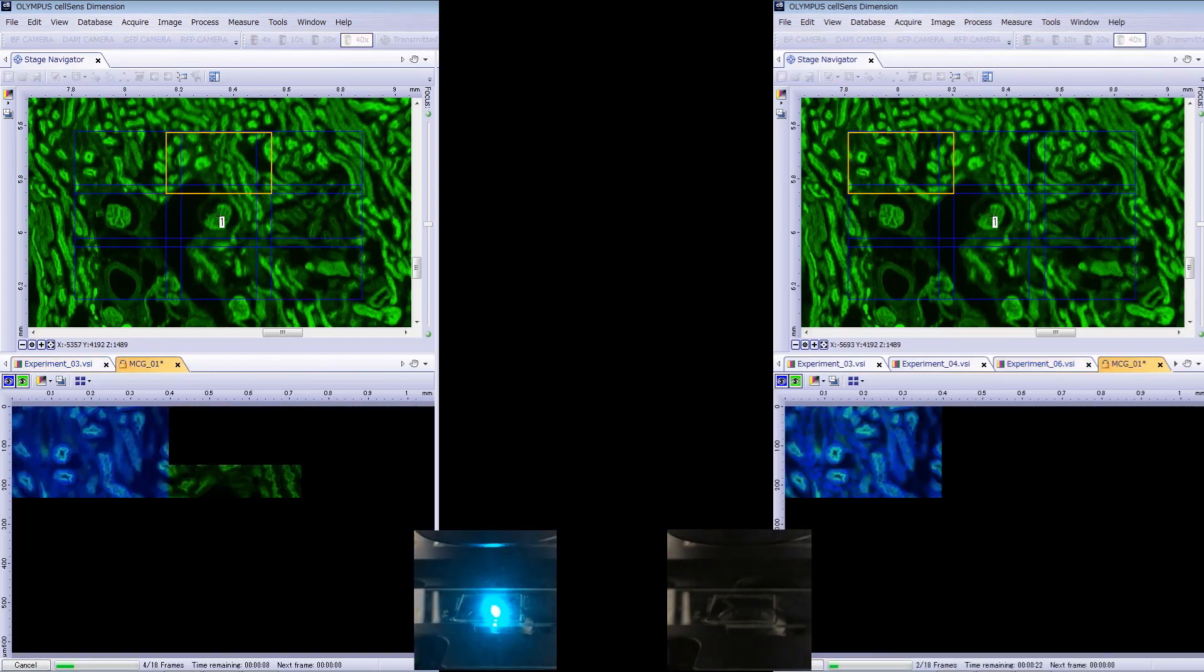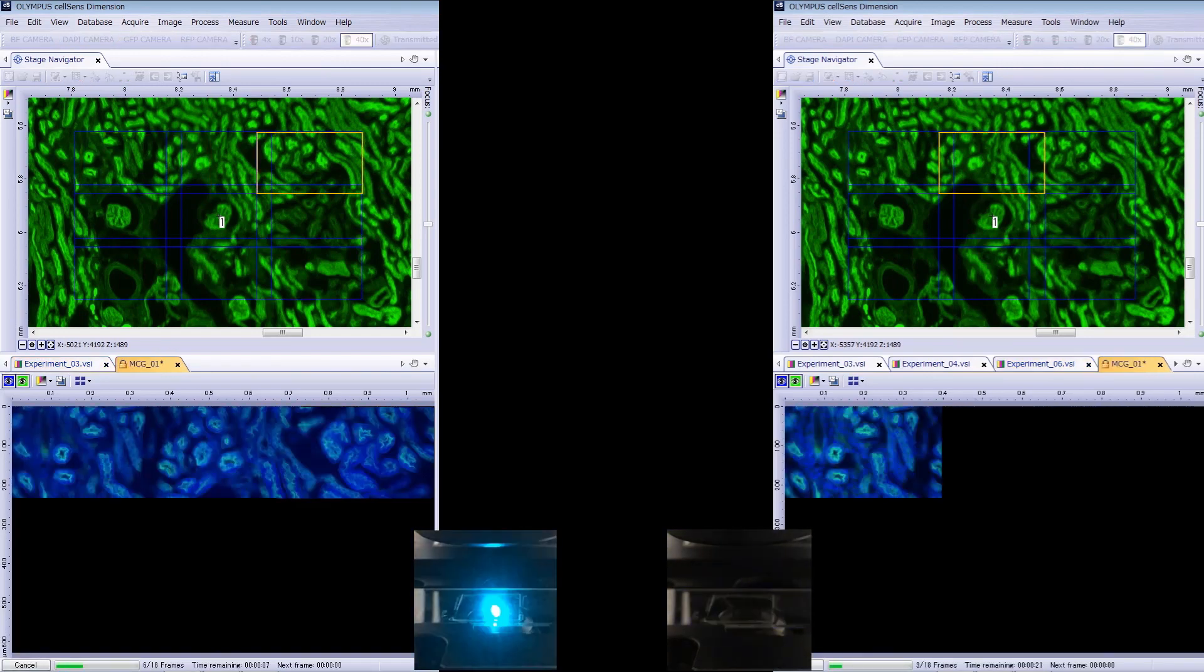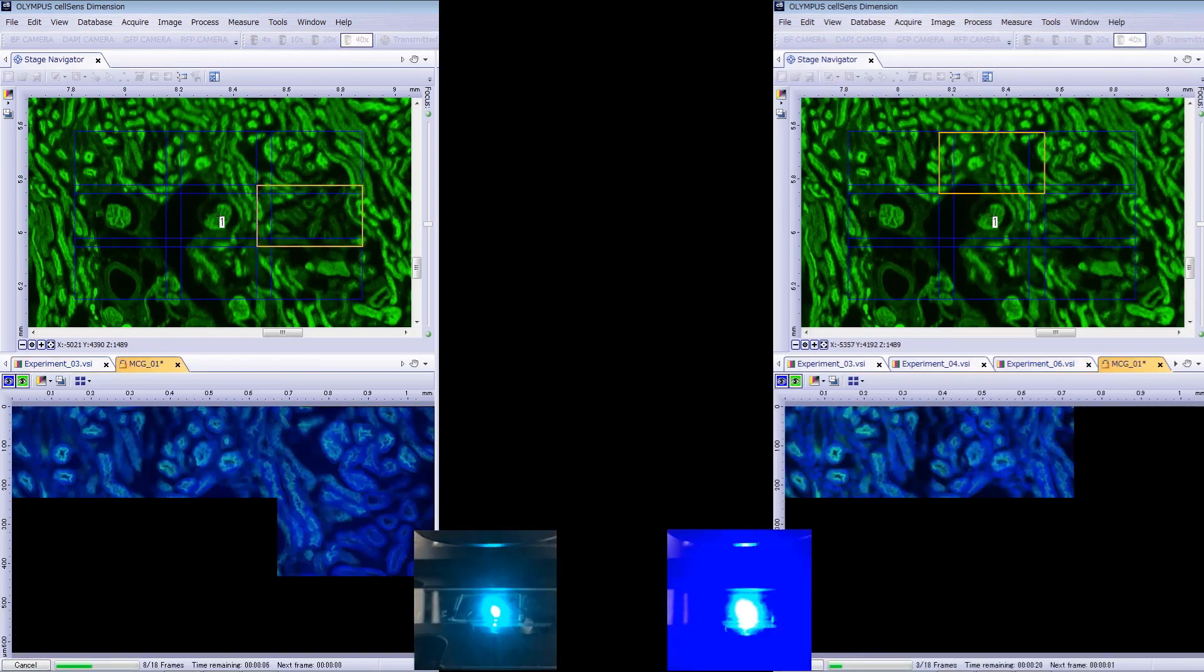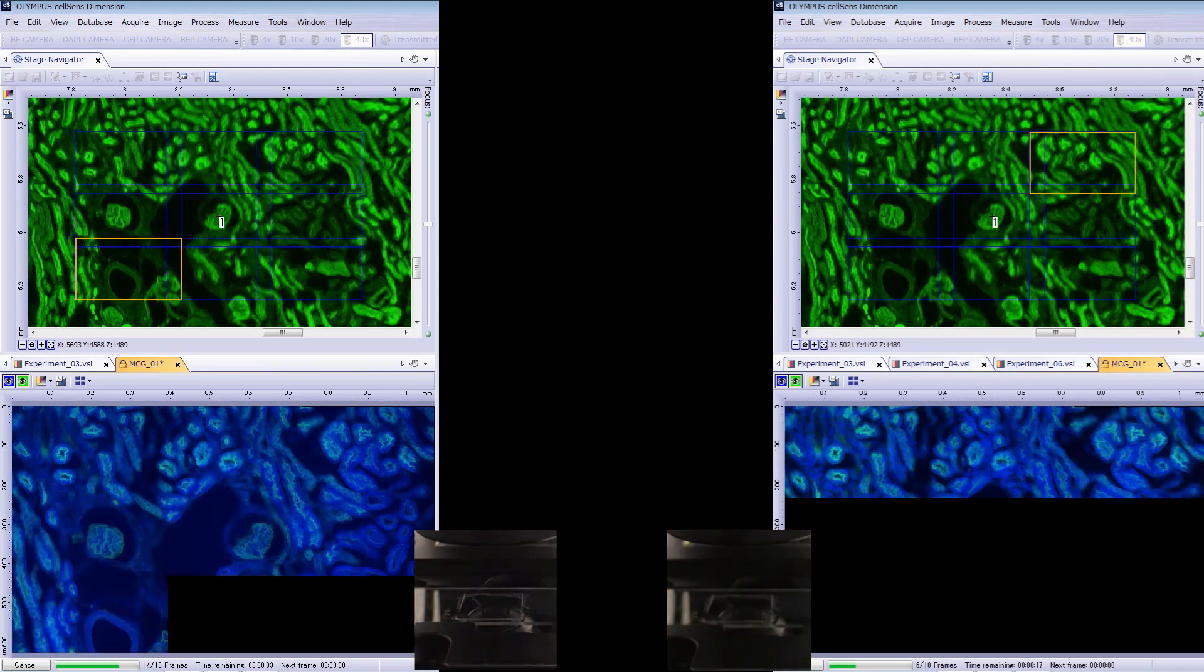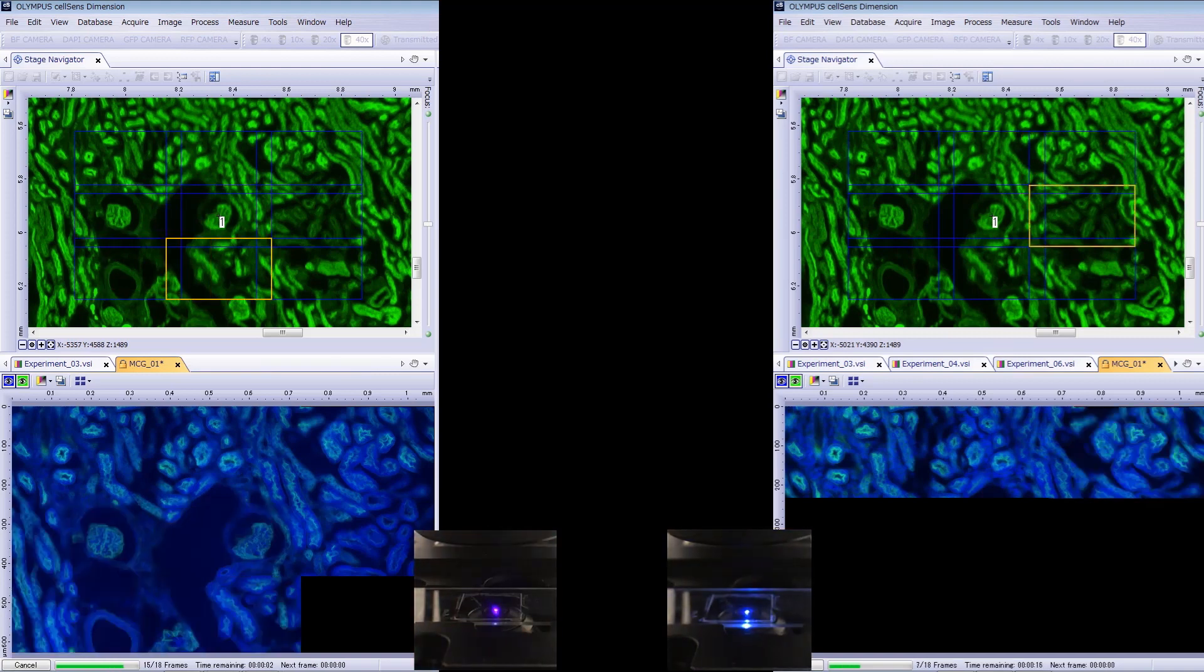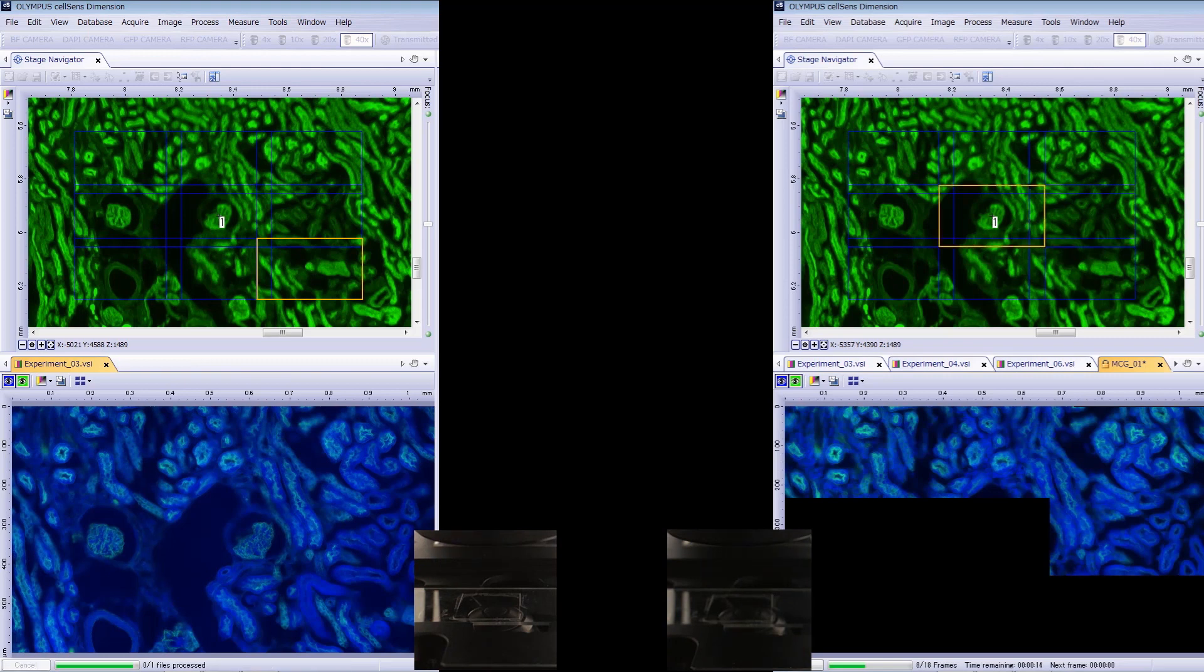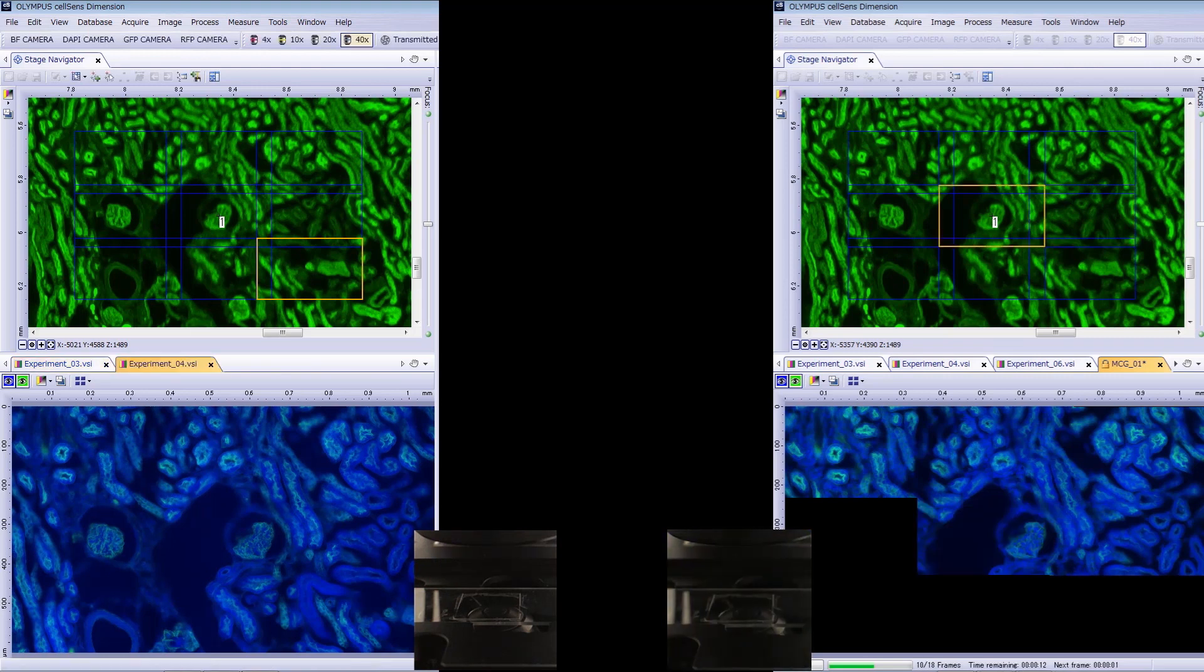On the left you can see the speed of a PE 300 ultralight source with a multiband filter cube compared to the same light source with separate DAPI and GFP filter cubes on the right.